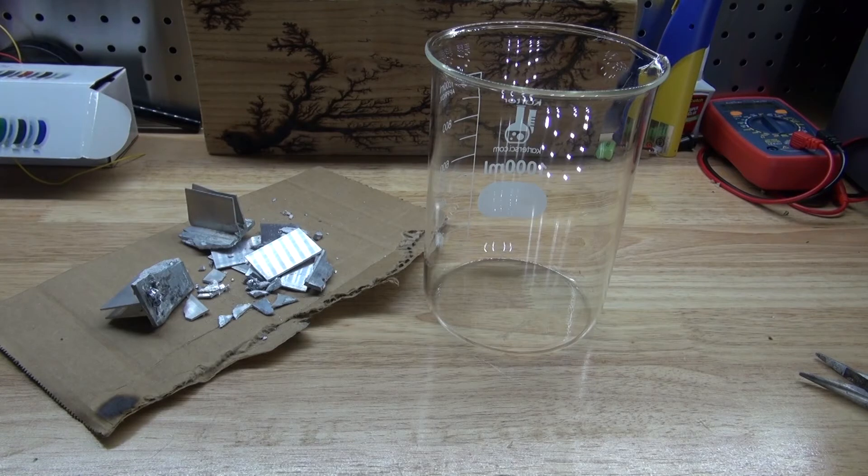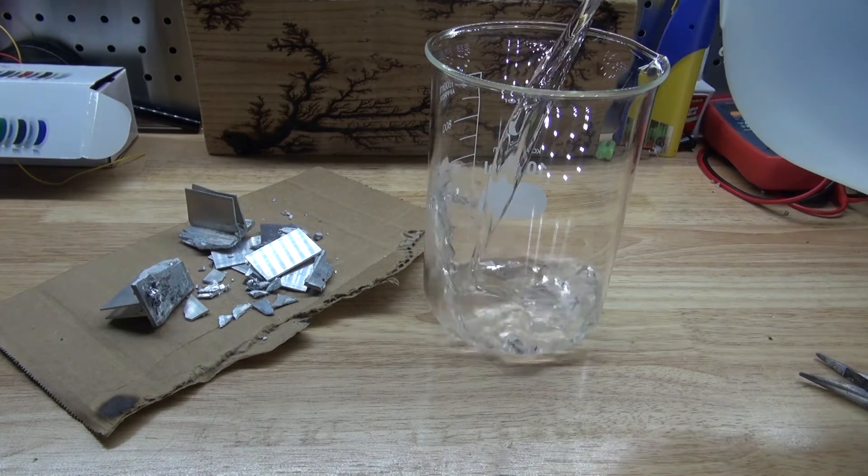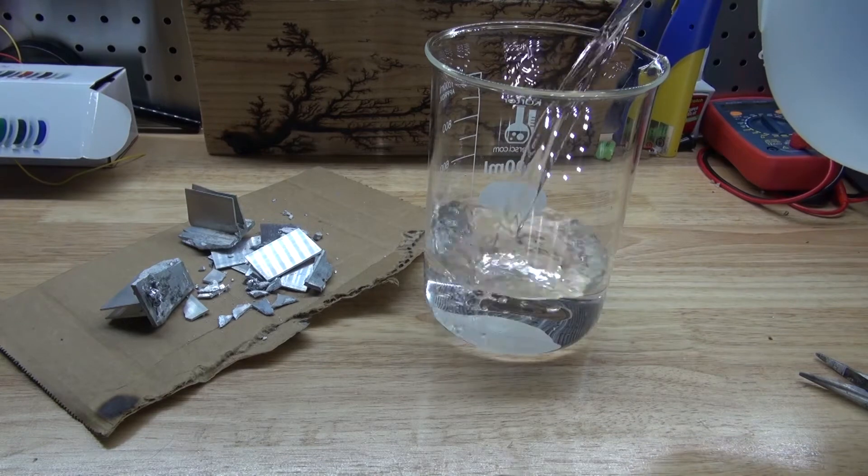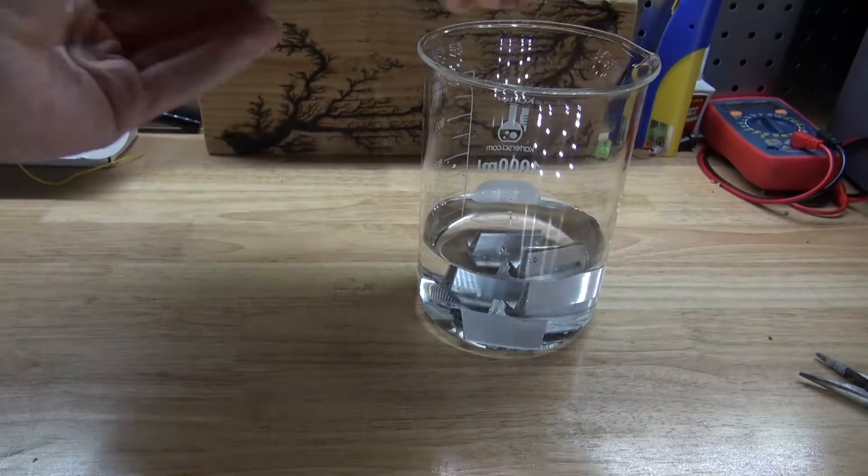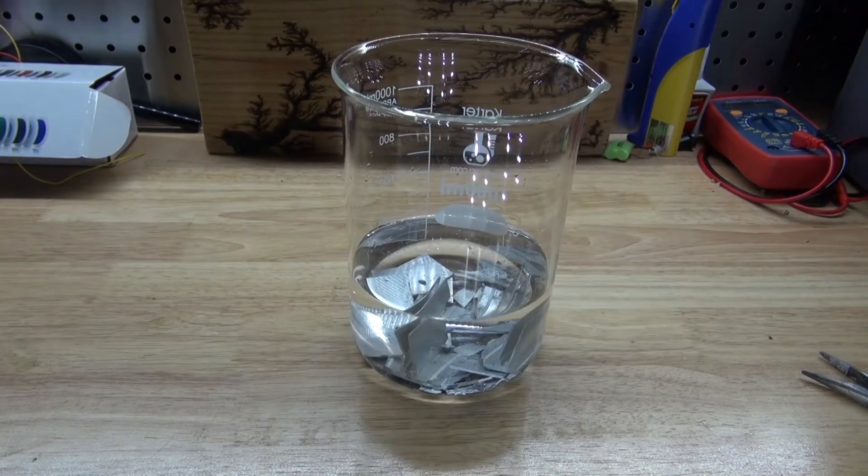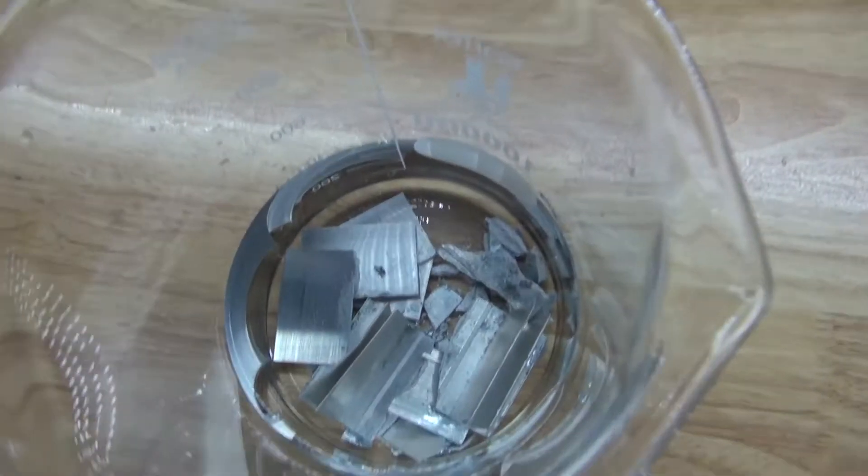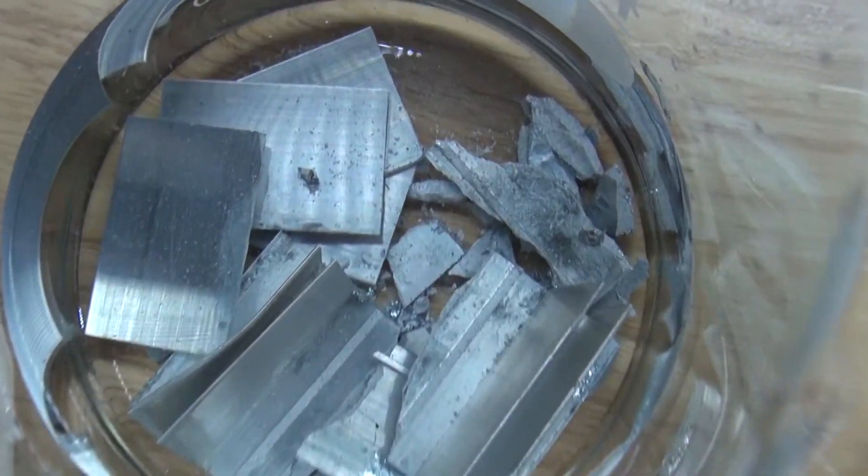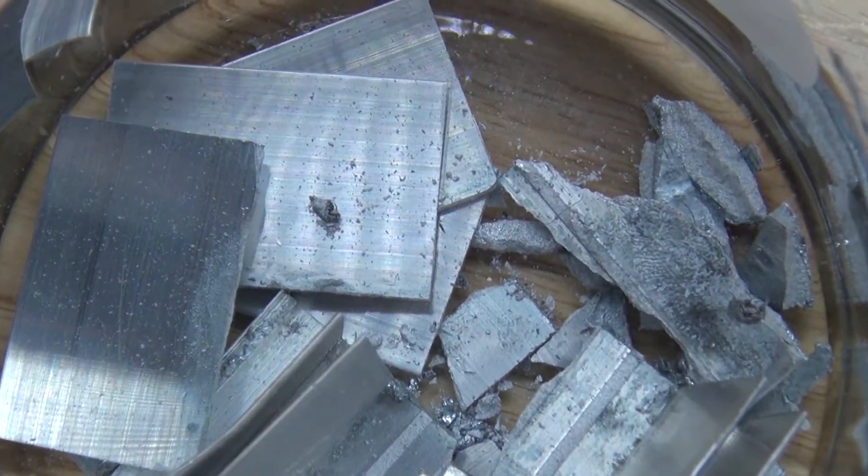So I have right here my beaker, and I'm ready to fill it up with some distilled water. And I'm going to go ahead and place this broken up heatsink inside to react it with the water. And as you can see, I waited about an hour, and there's a little bit of reaction. You can see some hydrogen being formed on top of the aluminum.